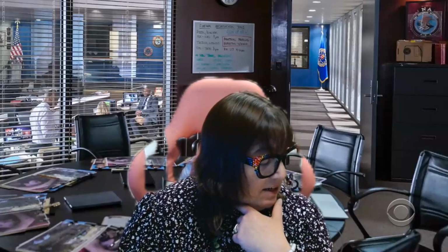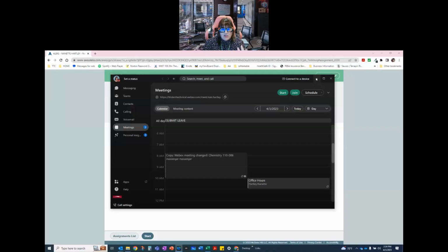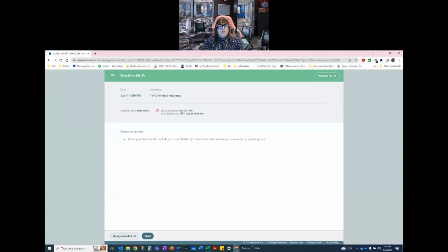This is lab lecture 7, so reactions, virtual lab 8. This is the one that we're talking about today. I'm going to go ahead and share my screen so that we can talk about this. And let's see what we're taking a look at. If we go into student view on this, you'll see this is reactions. You can do this as many times as you need to. We'll go ahead and start this.